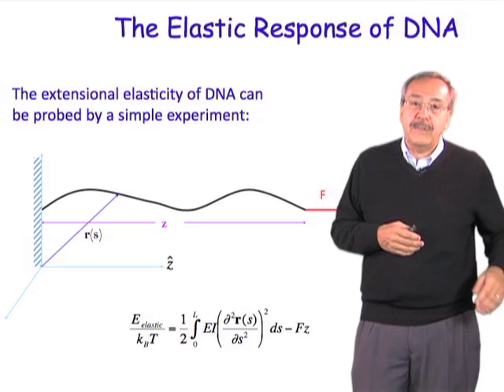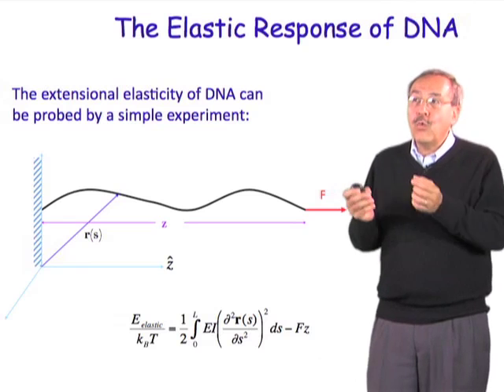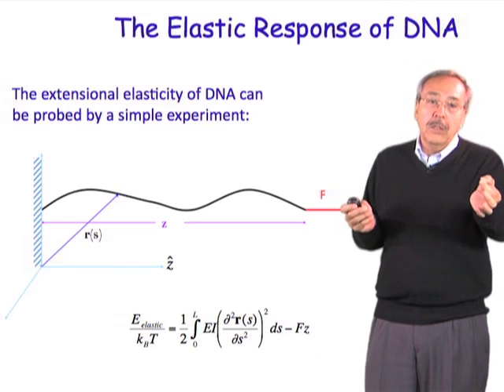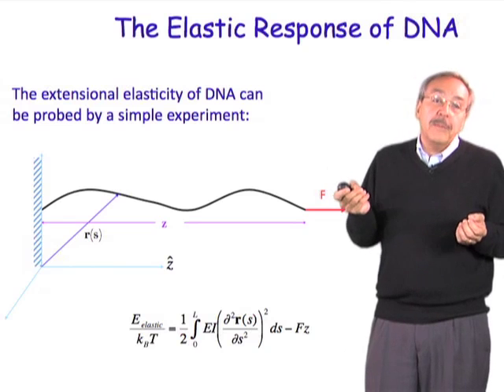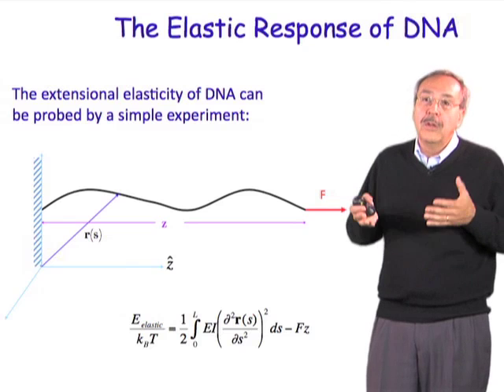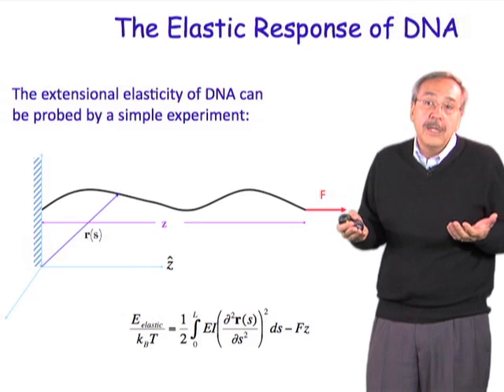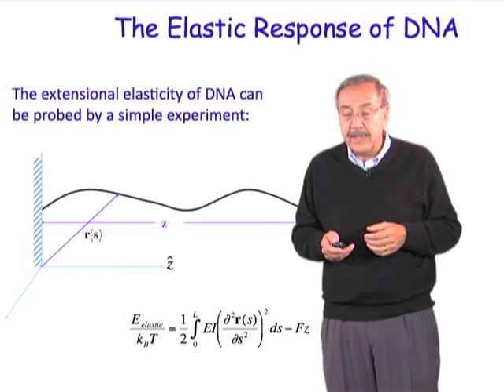And the idea is quite simple. As you see here in the slide, the idea is to attach one end of the DNA to a wall, right? And then grab the other end of the DNA and simply ask, how much force do I have to apply in order to extend the molecule a given amount? That's essentially to try to understand what the elasticity of the molecule is.